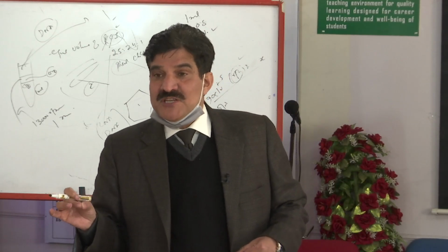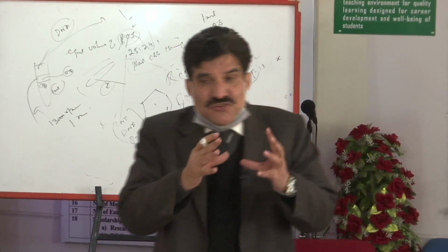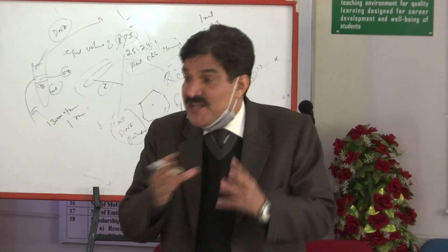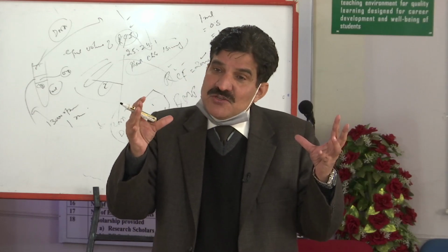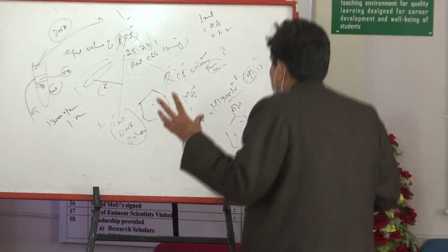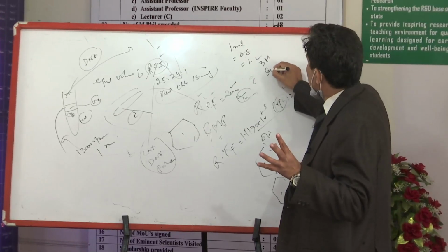I will explain the mechanism, but before that, one thing: in order to achieve good precipitation of DNA, you are adding something more. Anyone? You do it many times. Sometimes you are adding NaCl, sometimes 3 molar sodium acetate.